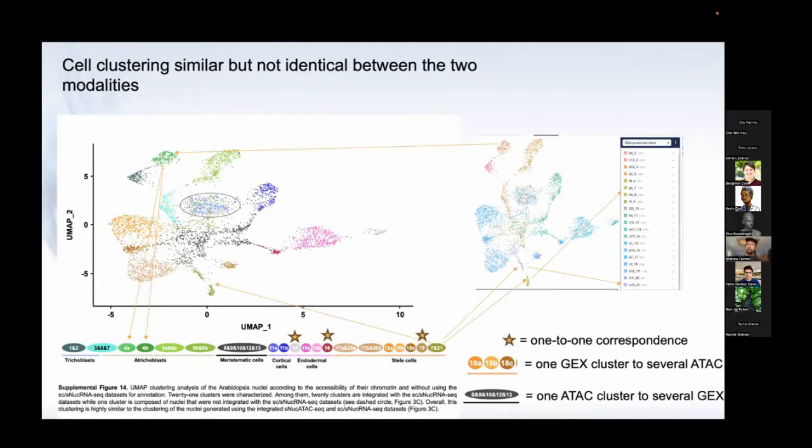And then one of the issues when you're dealing with unpaired data is that you can cluster things separately and use these integration techniques to project your assignments from one space into the other, but you don't necessarily get concordant results when you're doing that.